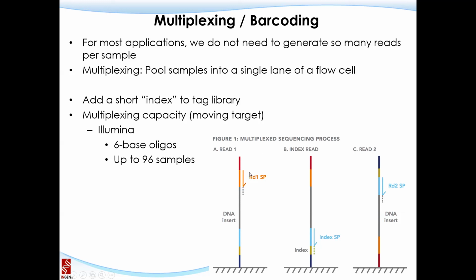In the past, we used informatics to decipher which one it is. But now it's integrated into the Illumina protocol. When they do the sequencing, they will automatically do it for you as long as you let the sequencer know what the barcodes are for each individual sample. Last time I gave a schematic view of how to do the analysis, but here is the way they really do it. This is that tree, right? And it will become a forest.